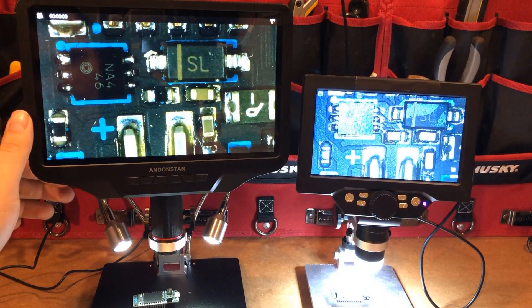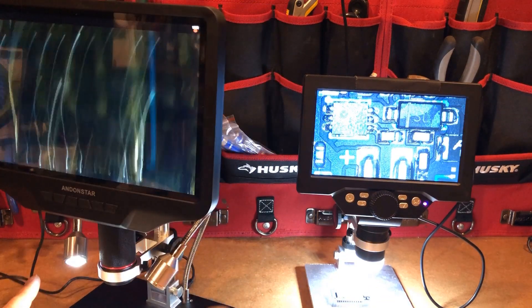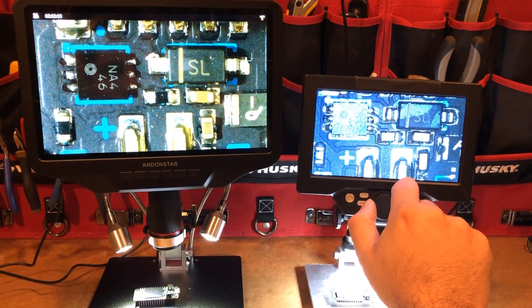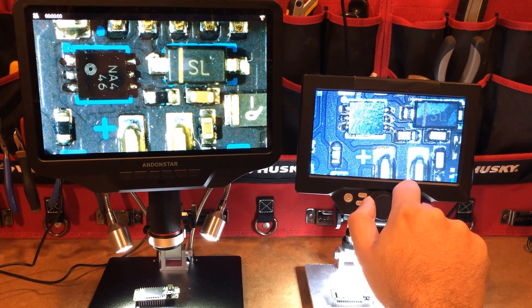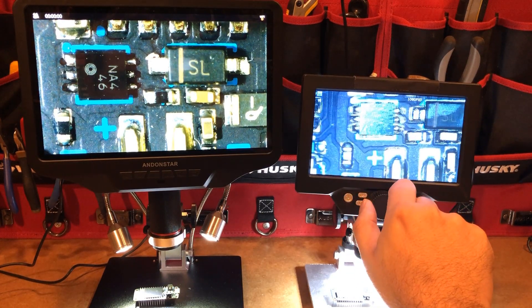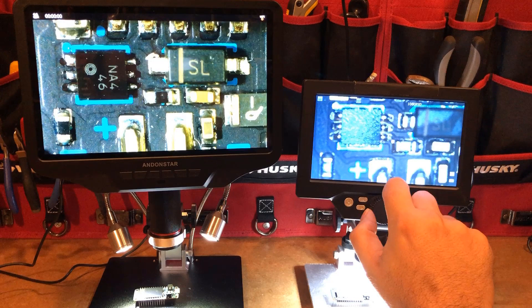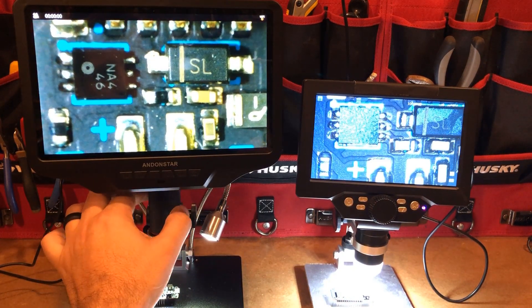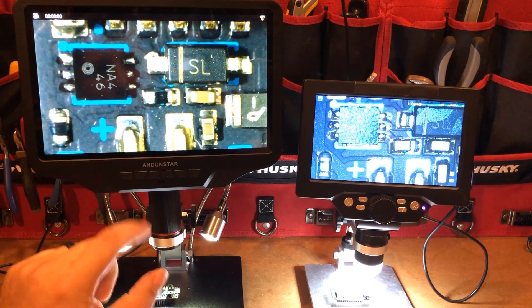I stand up a lot while I work, and the ability to tilt this to the right angle for me is really nice. On the other unit, you have to tilt the entire head. This one will allow you to tilt the screen independently of the optics. Now I wouldn't consider this device difficult to focus, but you kind of move the whole unit as you're trying to focus it and it has to be about perfect — if it's not perfect, it's not visible. I can kind of make out that little target symbol and see some etchings, but I never really get to where it's exactly clear. The field of view is so narrow that it's just really hard to get it in a place where I can see words clearly.